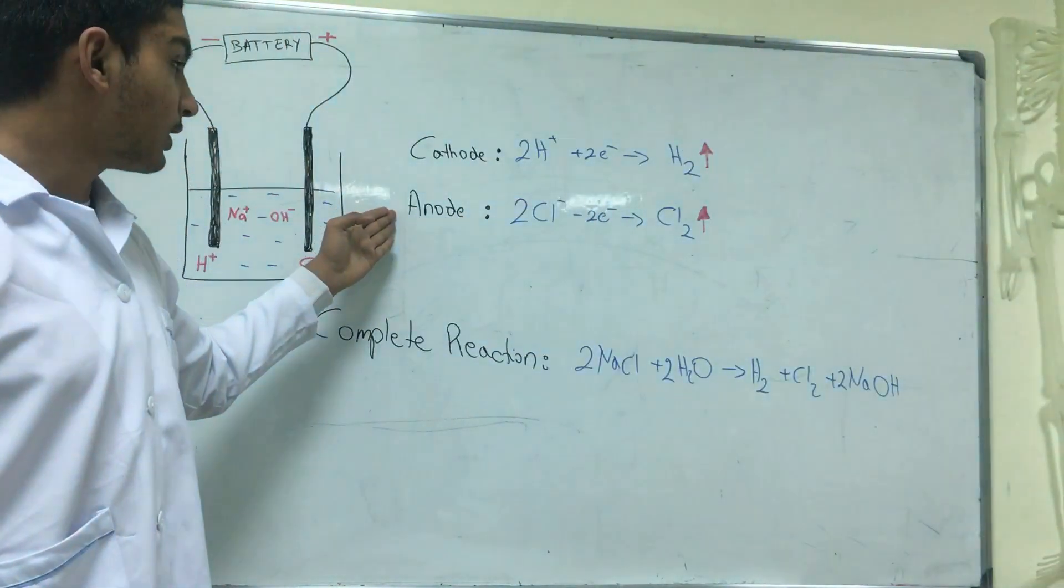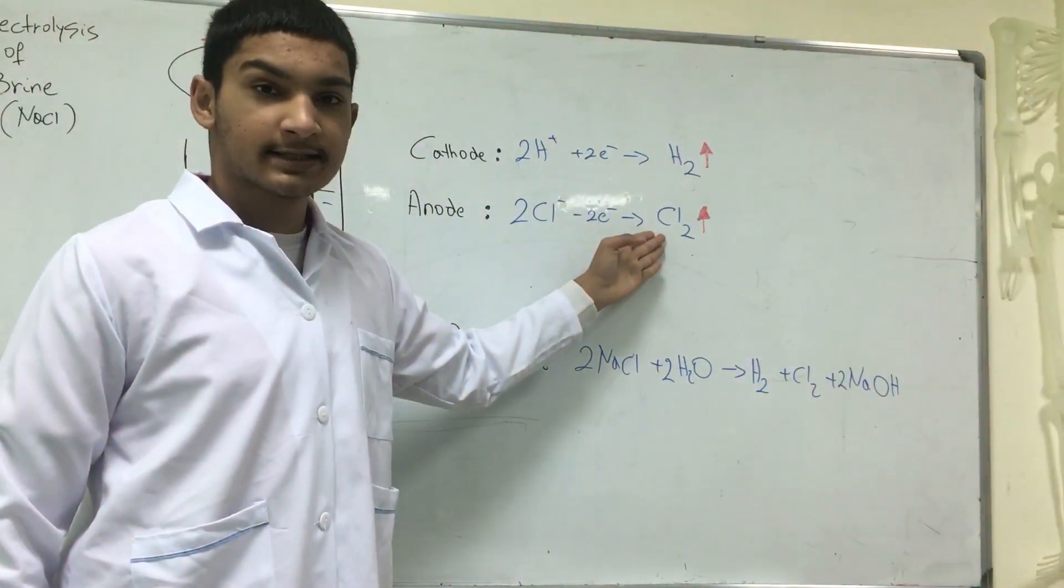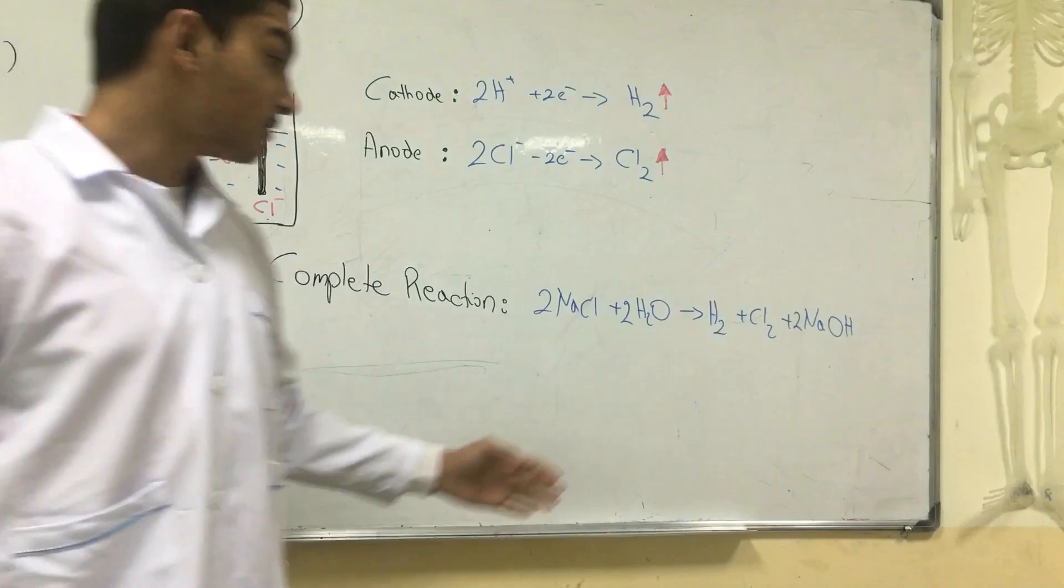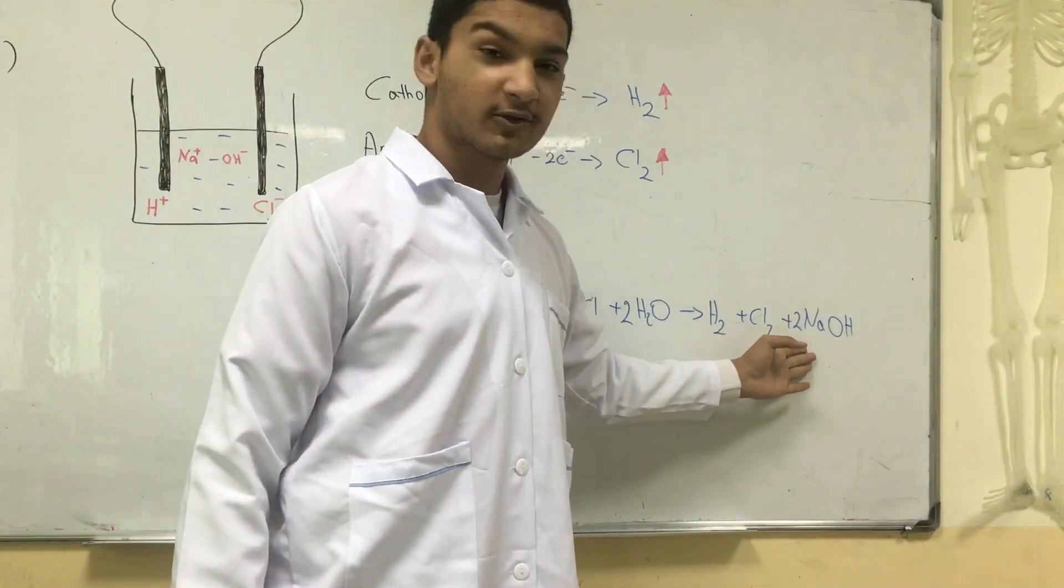At the anode we can see the production of chlorine as gases. Now we can see the complete reaction where the products are hydrogen, chlorine, and sodium hydroxide.